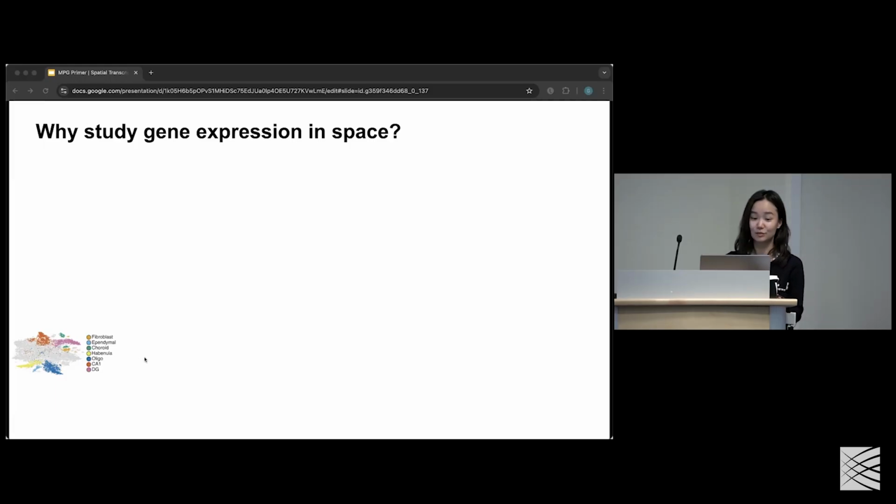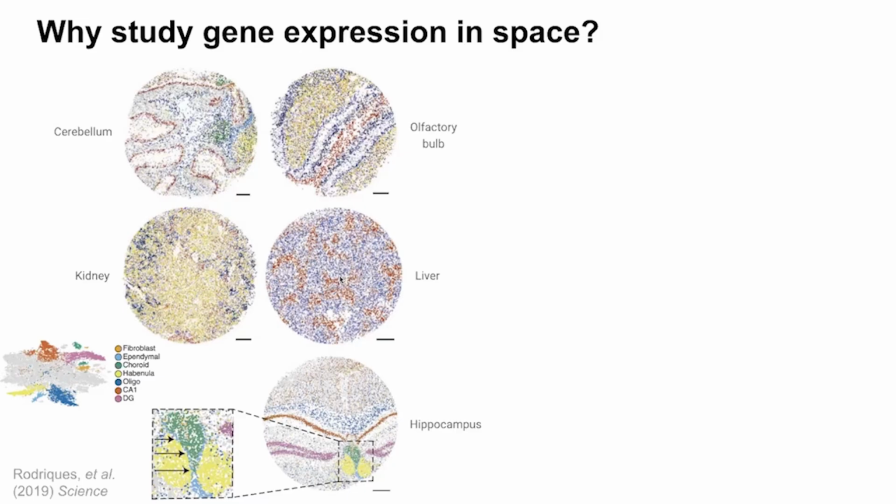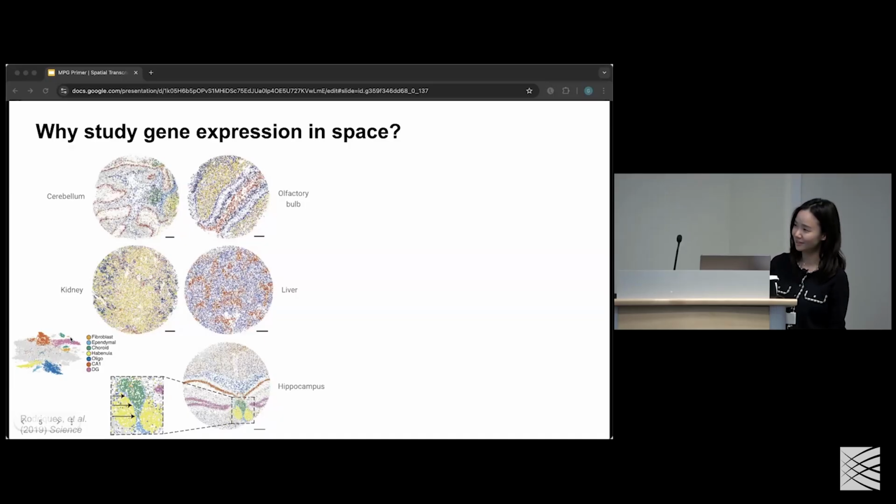that are perhaps associated with distinct regions. Now, the moment you put this into space, what you can see and begin to appreciate is that across these different tissue types, you now start to see, rather than just random dots in space that kind of cluster together, where they lie in space and what their neighbors look like. And you can even see that these ependymal cell layer, for instance, it's a single cell layer right near the hippocampus in the mouse hippocampus.